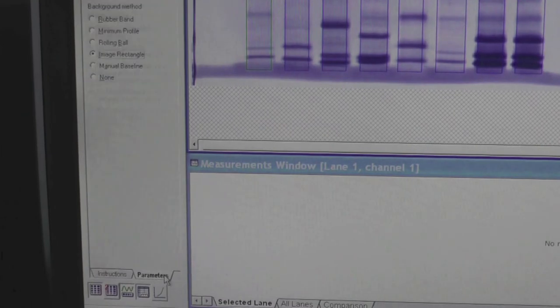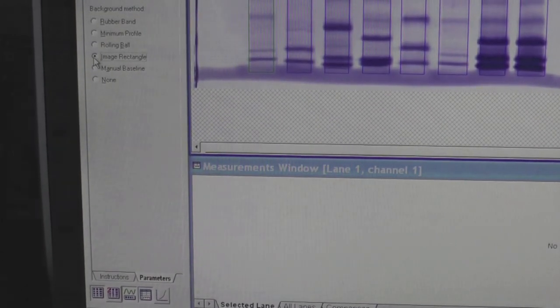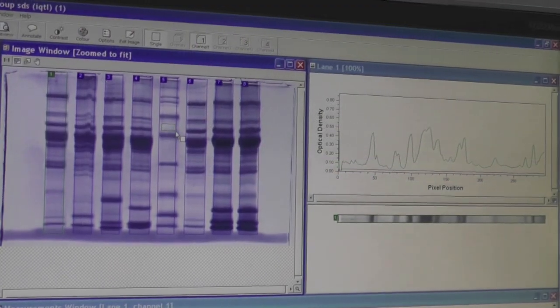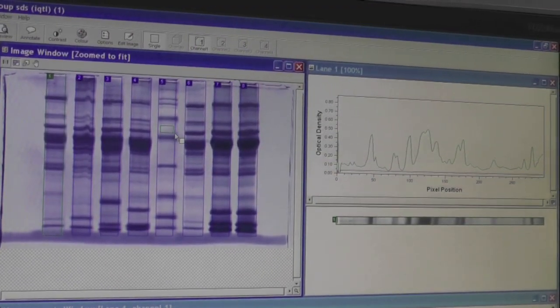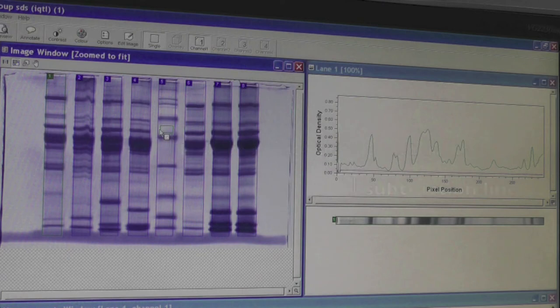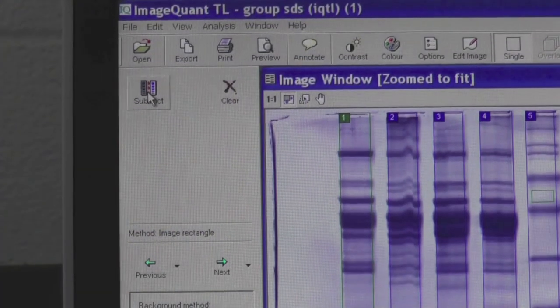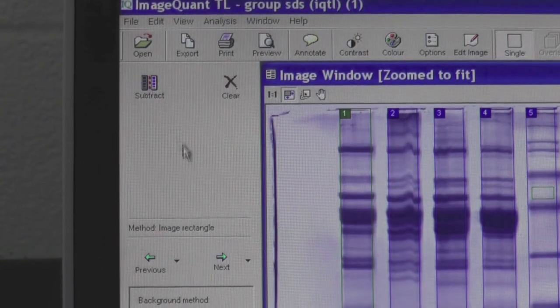Click on the Parameter tab again and select the Image Rectangle option. Draw a rectangle on the blank area of any selected lane. This will be your background color that will be subtracted from the color of your bands. Make sure the peaks shown on the graph are all above your subtraction line. When finished, click on Subtract and then Next.